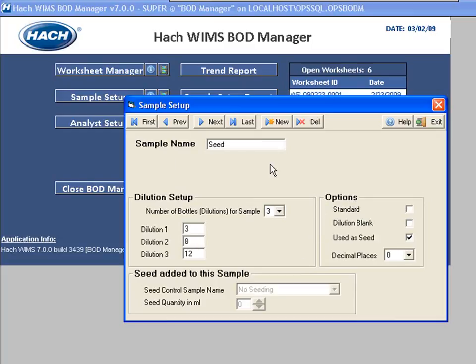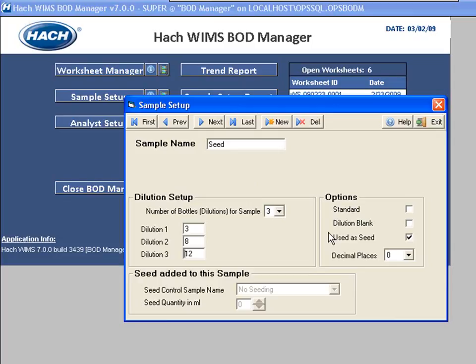I also have to set up my seed. If I happen to use seed, I'm going to create a sample name — something like 'seed' — and I'm going to check off that this is used as seed. I'm going to run three bottles at 3, 8, and 12 of this seed substance. When I check off in other samples such as Effluent that it was seeded, it knows to go look at these bottles to back-calculate that seed out of the result.